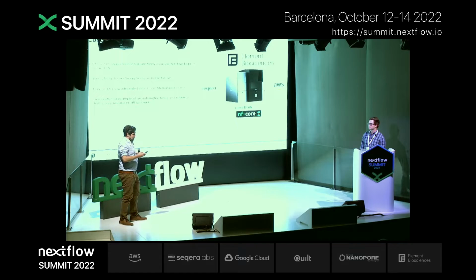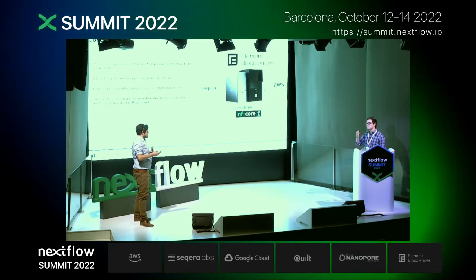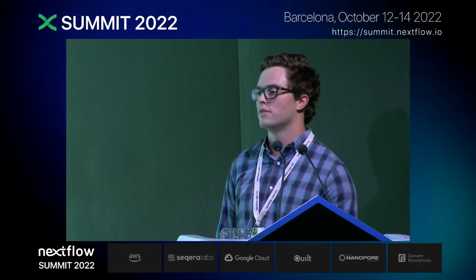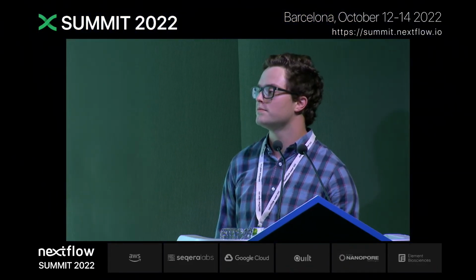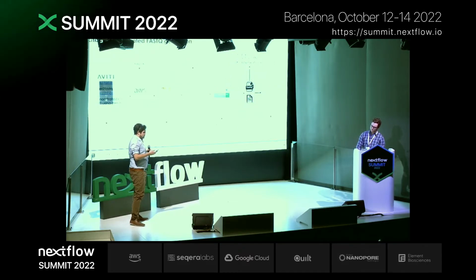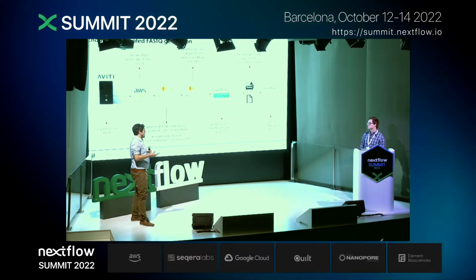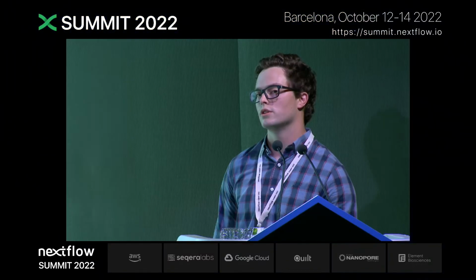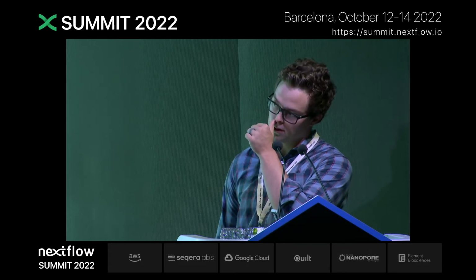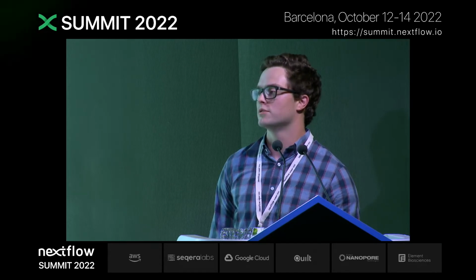This one's from Alan. I believe you may have covered it, but are the base calls and the demux tools different from the drop-in replacements? Yes, they are our formats. Another one from Alan: for the approach you showed using a Lambda function, have you considered trying the watchPath channel, essentially watching for those files, like watching on a local drive? Yes, exactly. No, we haven't tried that. I assume you could do that as well. You saw that in the previous presentation, similarly with the cron job.